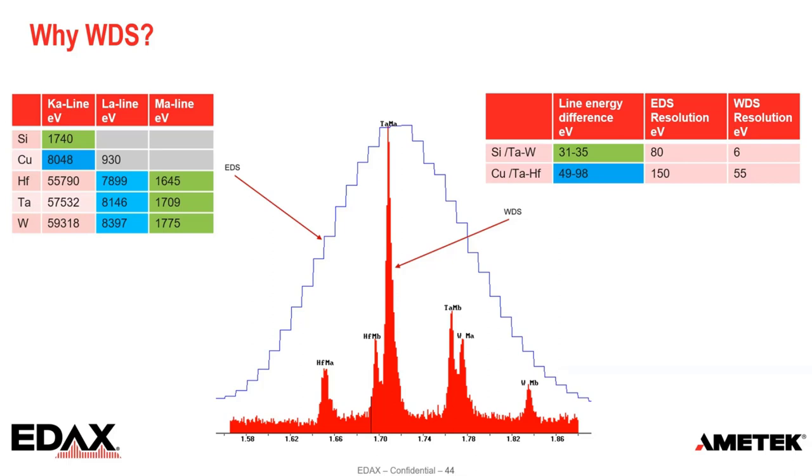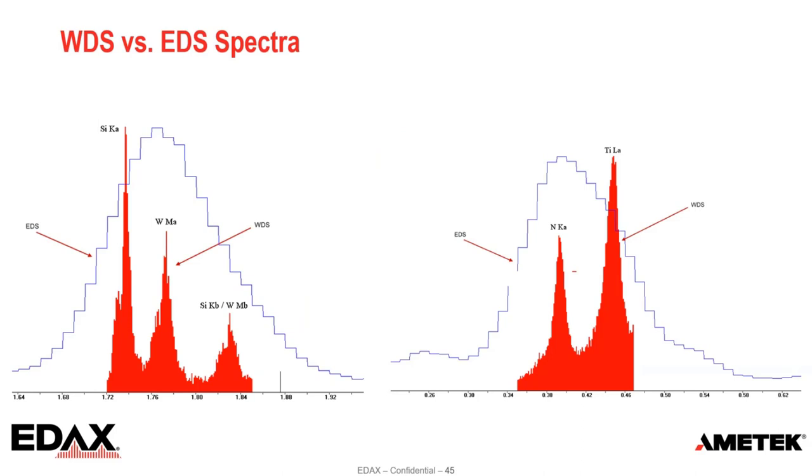This technique is complementary to energy dispersive spectroscopy in that WDS spectrometers have significantly higher spectral resolution and enhanced quantitative potential. WDS is used for non-destructive quantitative analysis of spots as small as a few micrometers at low detection levels and for elements from atomic number 5 and higher. It is possible to work with natural and synthetic solid materials like, for example, minerals, glasses, tooth enamel, semiconductors, ceramics, metals, and even more.